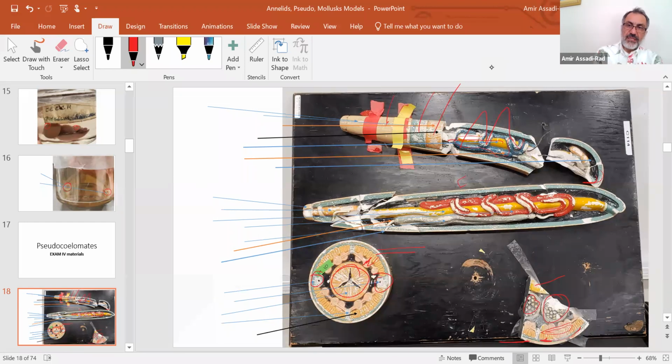Female, this is a female, the whole entire, this is intestine, the yellow, and anus, mouth is in this area. And you have the nerve, cerebral ganglion, uterus, two of them, vagina, and genital port right there. The black area is pseudocoelom, ovary, and oviduct. They did not do a good job of presenting it, showing it in here.